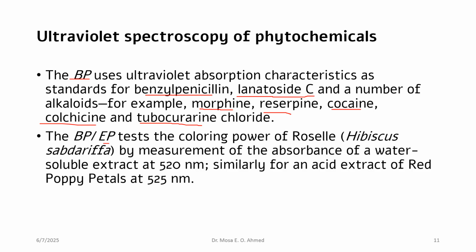Also, the British Pharmacopoeia and European Pharmacopoeia test the coloring power of rosa hibiscus sabdariffa, which is karkade, by measurement of absorbance of a water soluble extract at 520 nanometers. Similarly, the acid extract of red poppy petals is measured at 525 nanometers.